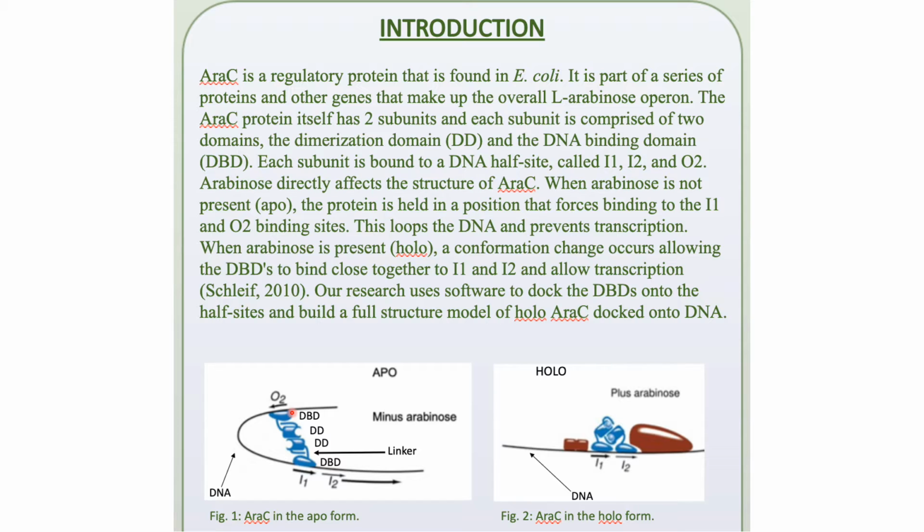The structures of the DD, DBD, and DNA are known independently, but the structure of the whole AraC and DNA complex is not. Our goal was to use software to create a whole AraC DNA complex that models their natural interactions.